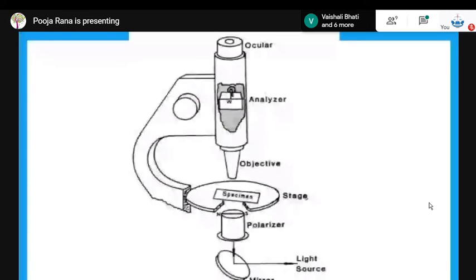All right. Now, talking about fiber and soil, to see their structure and analyze what that particular fiber is made up of, since sometimes there is a confusion between fur and wool, to check the structure we would be subjecting that fiber to a polarized light microscope. Soil samples would again be going to the chemistry division, where they would be checking the structure of the soil particles in order to get to know what type of soil it might be, along with other properties like water retaining property and the density gradient method. Those are separate methods, but fiber and soil can be examined under a polarized light microscope. Fine.